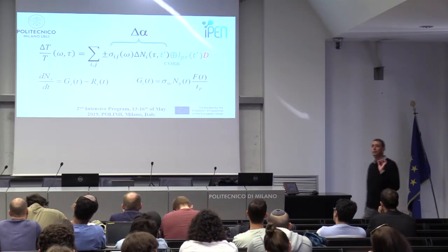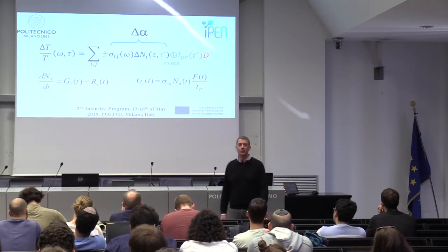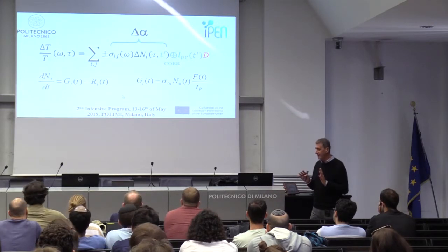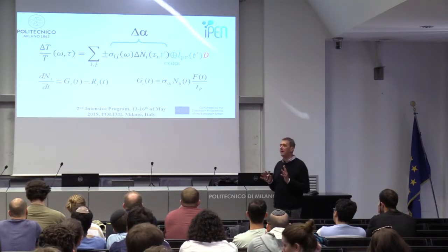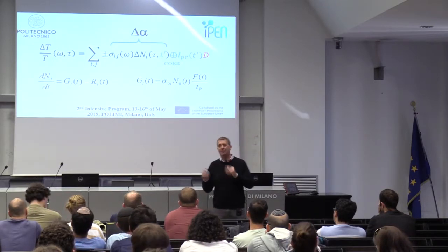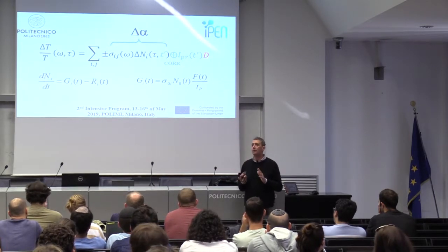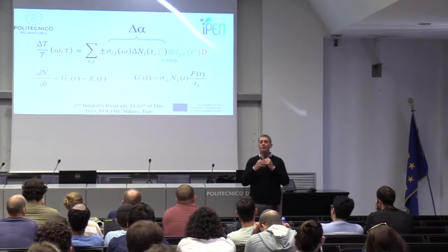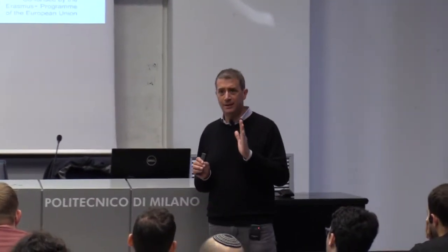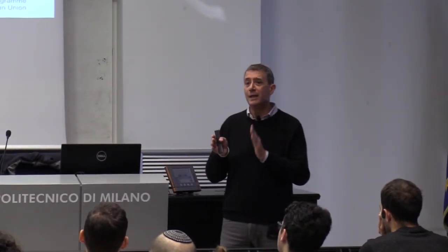Now, about time resolution, there is another detail I should tell you, but it's early morning, so you can follow some simple mathematics. The time resolution story is like this. The probe pulse and the pump pulse are not delta, right? They are not infinitely short. They have a time duration. Now, the best thing is to study a phenomenon that is much slower than this time duration, so you can forget about this. That's the easiest thing. It's more reliable, I would say, in the experiment. Sometimes you cannot. Sometimes you are measuring something which is more or less the duration of your pulse.